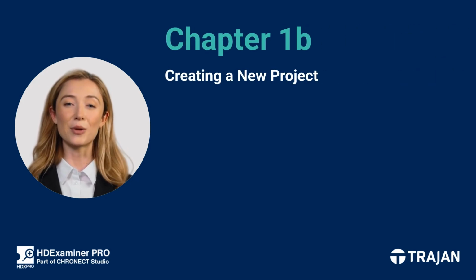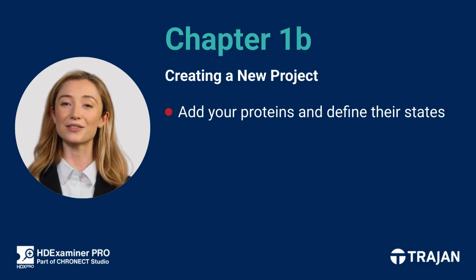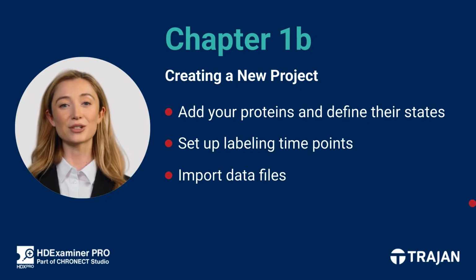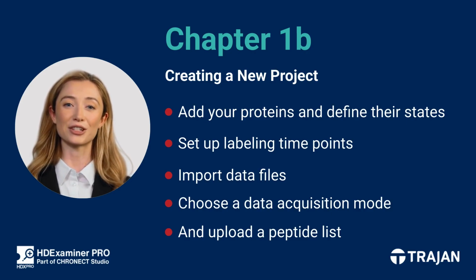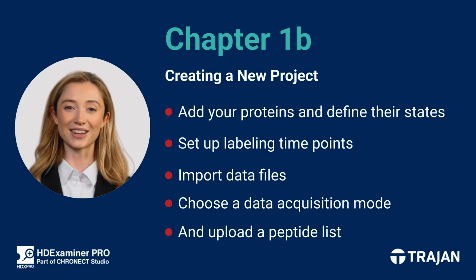In this segment, we'll walk through how to create a new project. You'll learn how to add your proteins and define their states, set up labeling time points, import data files, choose a data acquisition mode, and upload a peptide list. We'll finish with a look at the project summary and structure, so you're fully set up to begin your HDX analysis. Let's get started.